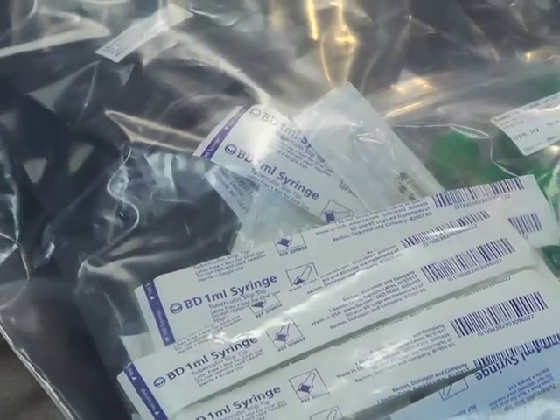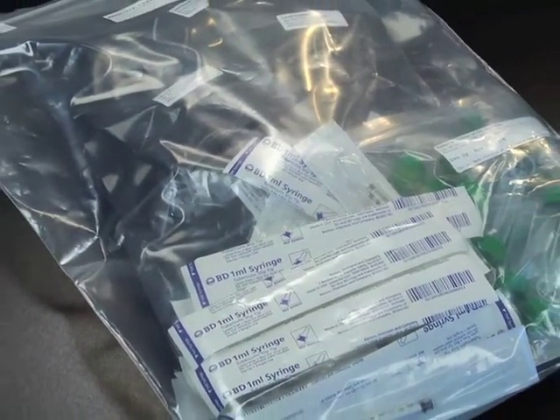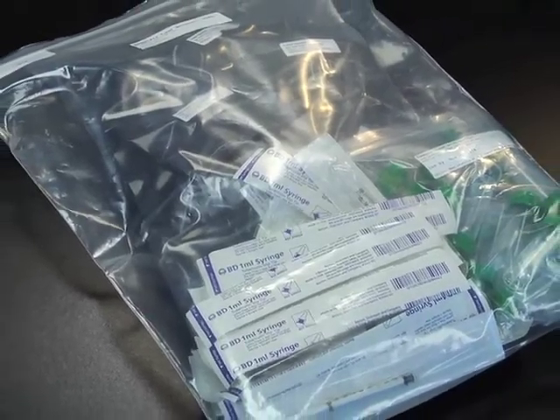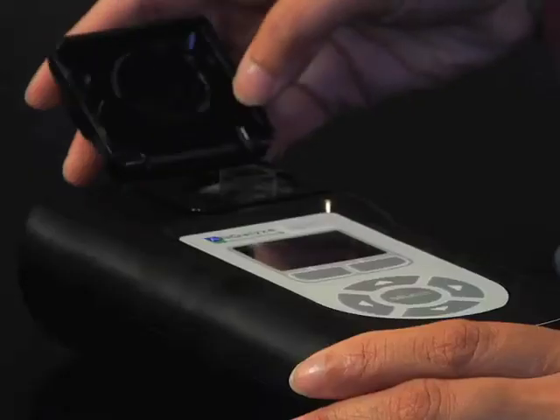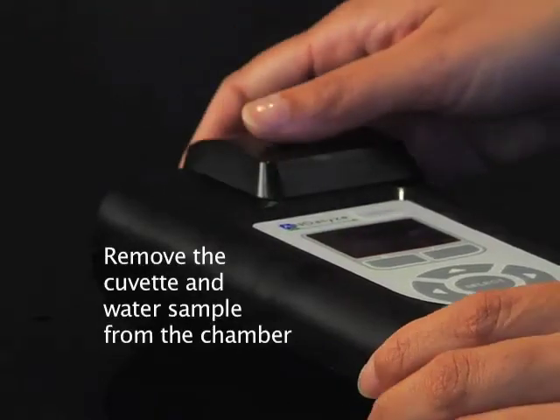The syringe, sensor, cuvette, and sample tube should not be reused. Dispose of or recycle all of these consumable items. Remember to remove the cuvette and water sample from the chamber before moving the fluorometer.